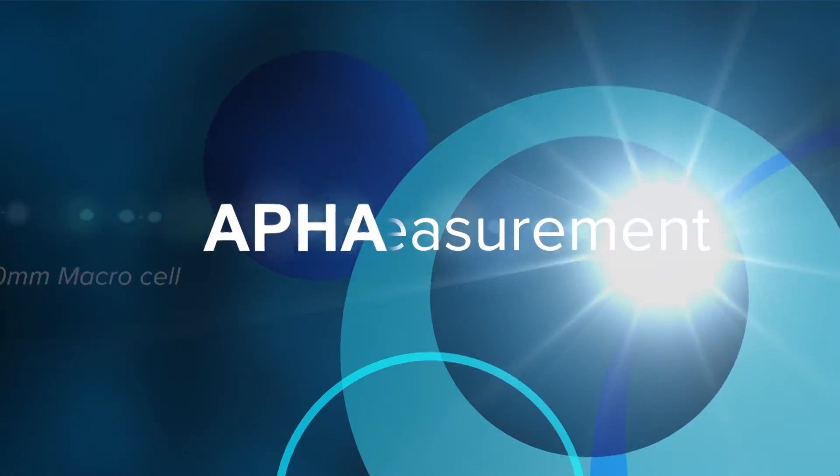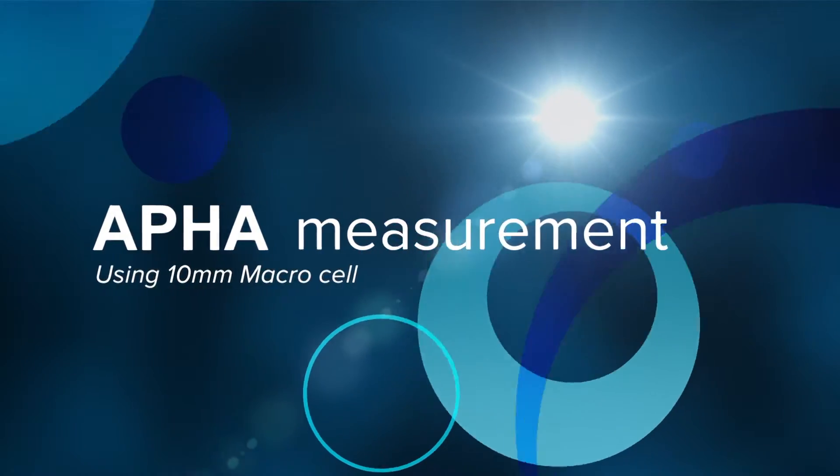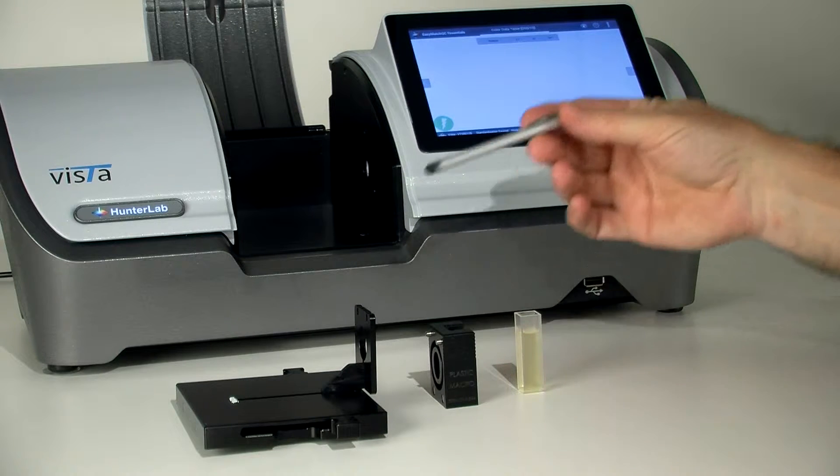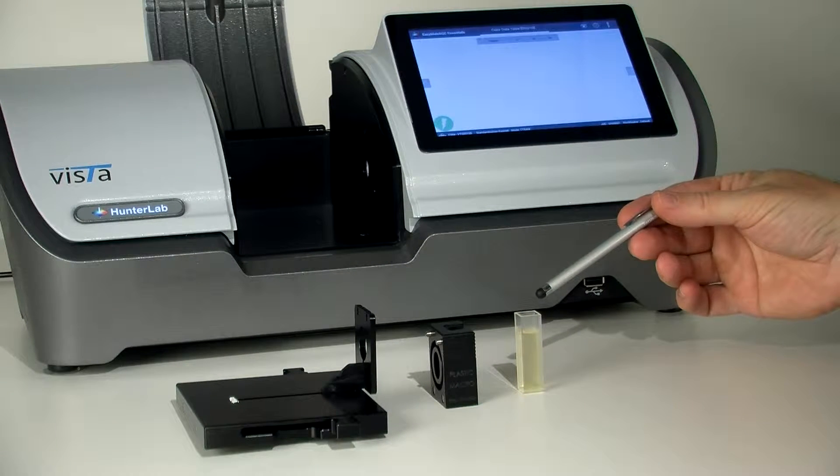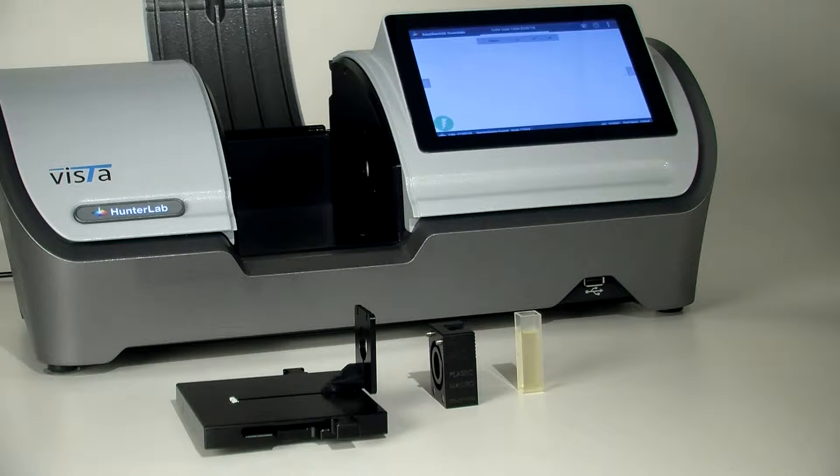This video demonstrates how to measure APHA using the film and cell holder base plate, macro cell holder, and a 10 millimeter cell. Make sure the instrument has been standardized using distilled water in the same size and type cell used for your samples.